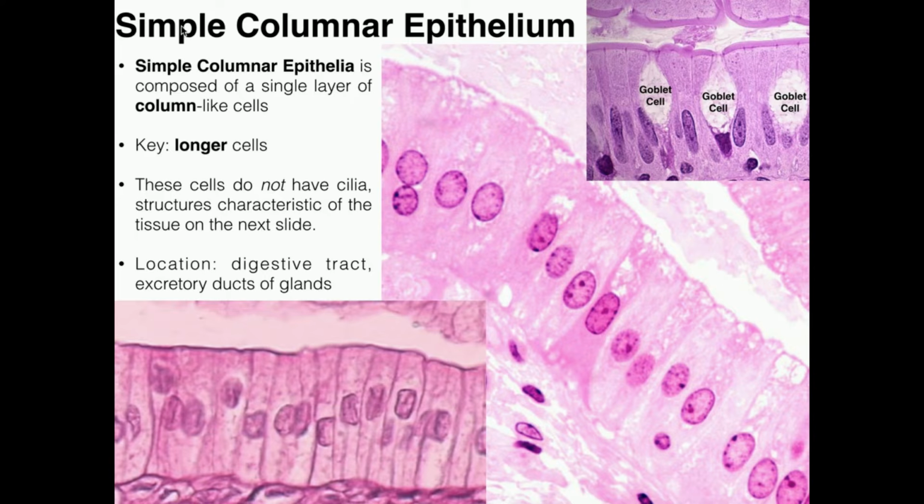In this type of tissue, if you're given this, you need to pay close attention to whether it says name the tissue or name this cell that I have an arrow pointed to. I may have an arrow pointed at the goblet cell itself, all right? And again, here's the lumen up here where my mouse is. In this picture down here, this would be the lumen. There are not really super clear goblet cells, but I might guess this one might be, since it didn't stain, but these 3 right here are definitely goblet cells.